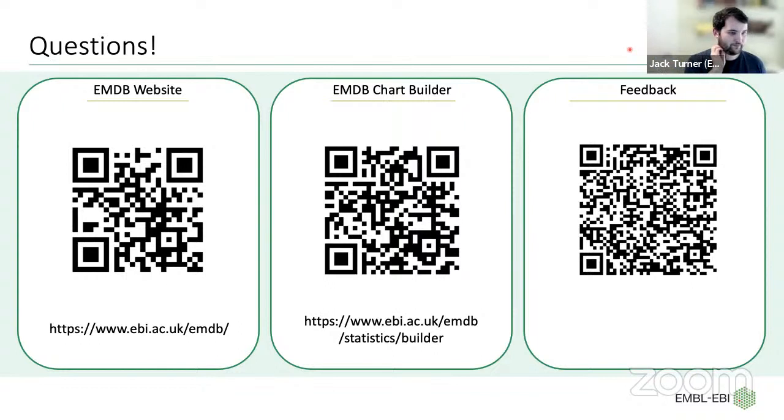Yeah, absolutely. Even with the EMDB, maybe a user should know what type of refinement they're doing in RELION, but they don't. If you say you're using RELION and what job you're doing, and it auto-populated that information, it would be there. Instead, they're just going to skip it instead of trying to figure out what it is. Or you can even put the pressure on RELION or CryoSPARC to make a little disclaimer: these are the types of things that these do, so the information is out there. It doesn't have to be your job. I just get tired of answering the same question over and over again.